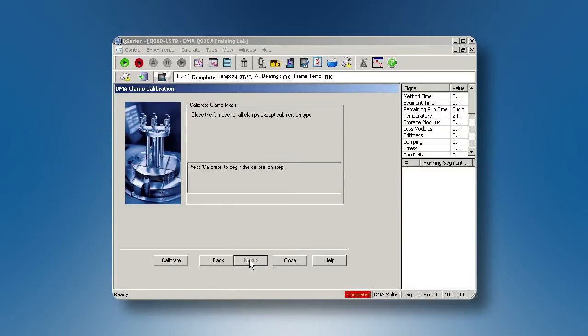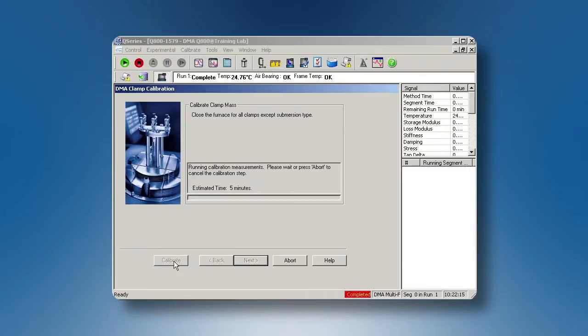Close the furnace from the instrument touch screen. Then, click on Calibrate.